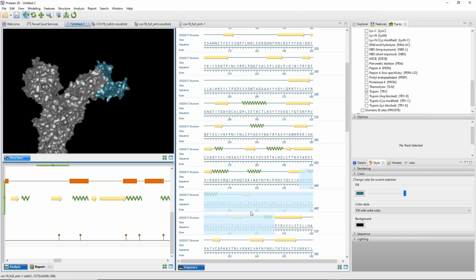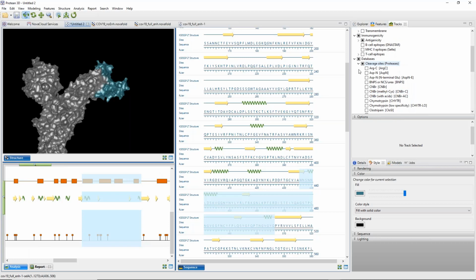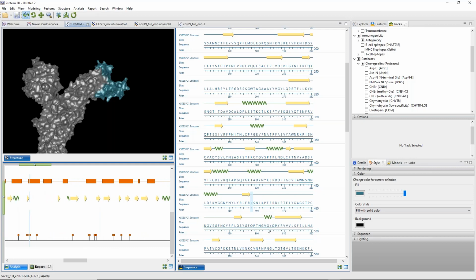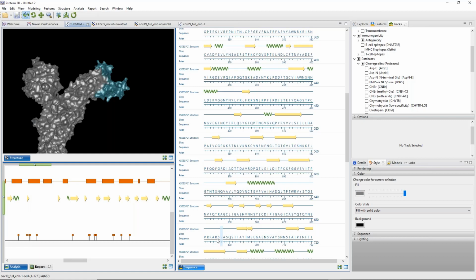But anyway, if we look at that region and then compare it to this region right here that we're looking at with the trypsin cleavage sites, we see that there's a whole cluster of cleavage sites right here. There are some important cleavage sites that we have to understand in these regions. I believe it's actually at the 685 junction right here. So right here is where the S1/S2 cleavage site is, and this is what's required for the fusion protein to be exposed. And you can see that there are these 3 cleavage sites really packed together. Now this is a region that's interesting because I believe there's some evidence that that region has diverged from some of the earlier strains.